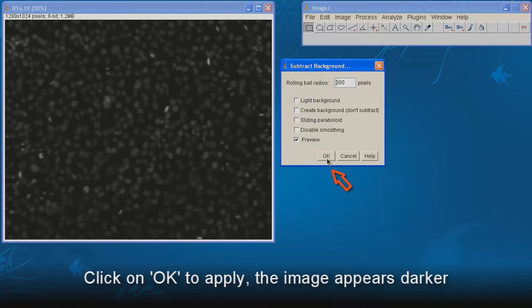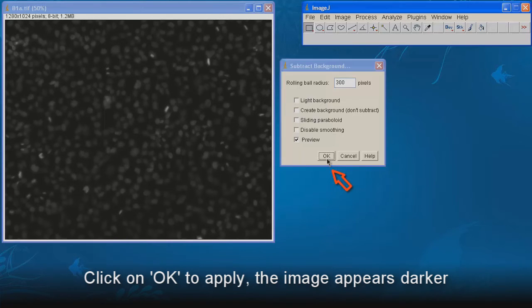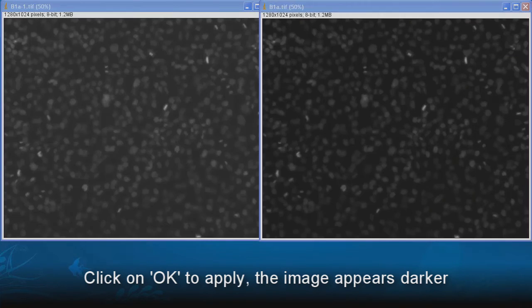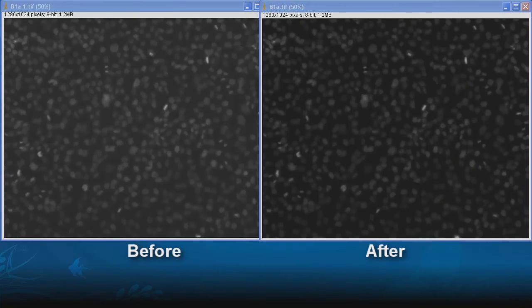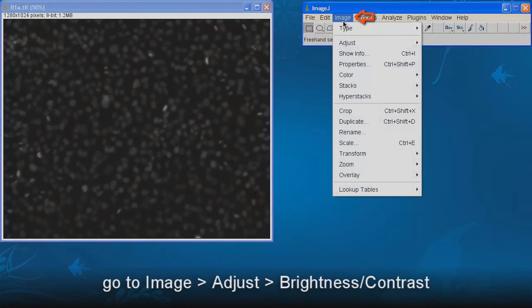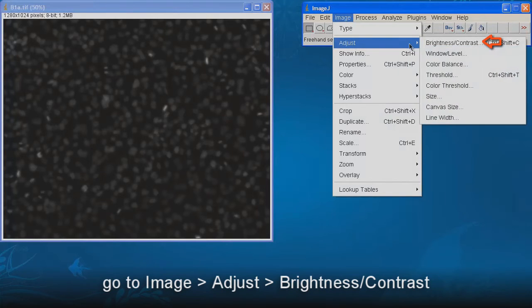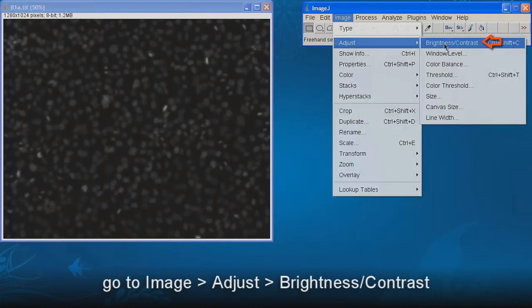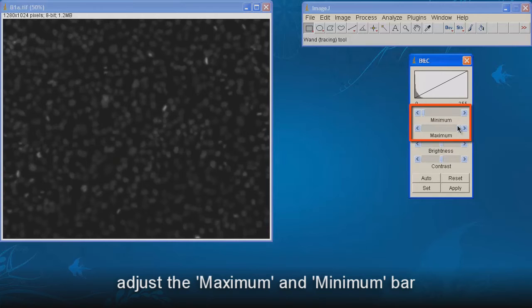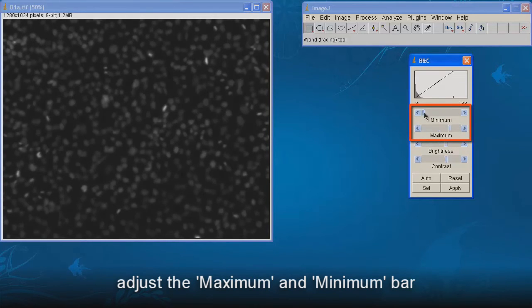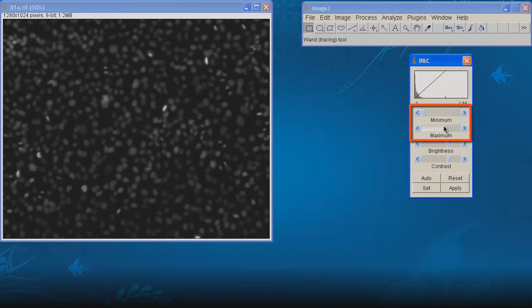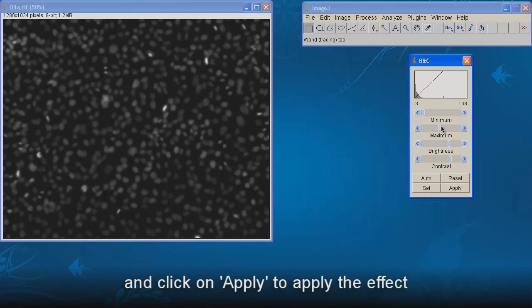Click on OK to apply. The image appears dark. To rescale image intensity, go to Image, Adjust, Brightness and Contrast. Adjust the maximum and minimum bar. Click on Apply to apply effect.